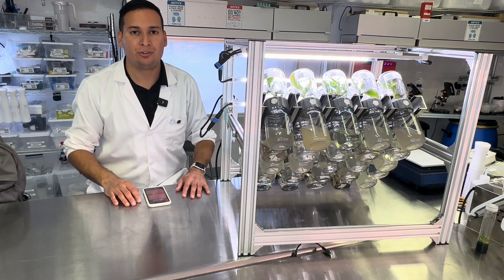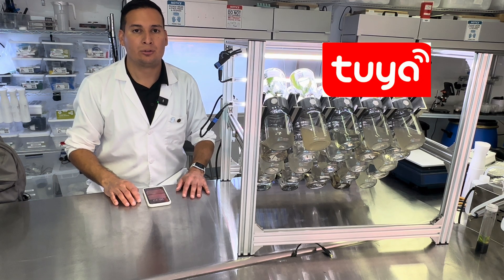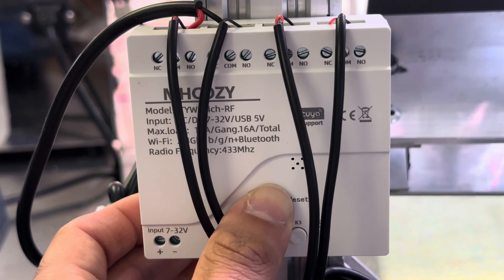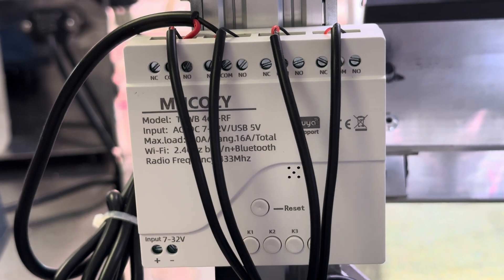To program your BioTil, first you need to download the Tuya app from your Android or iOS App Store. Then you need to restart the controller of the BioTil, located on the back of the device, by pressing it for 5 seconds.